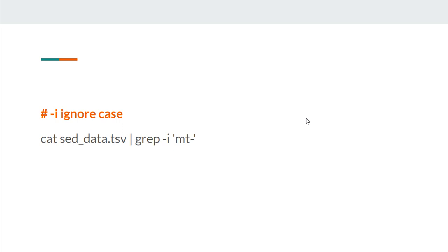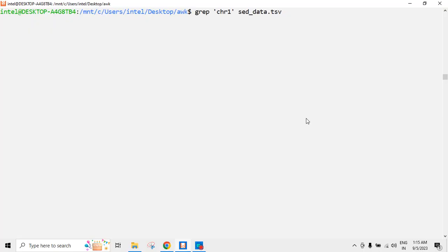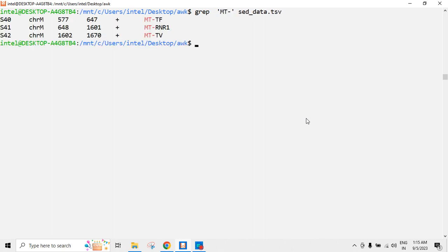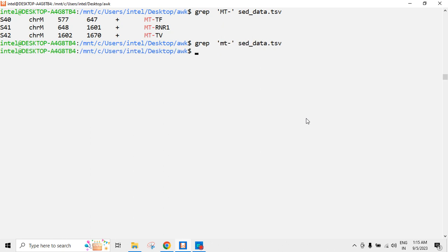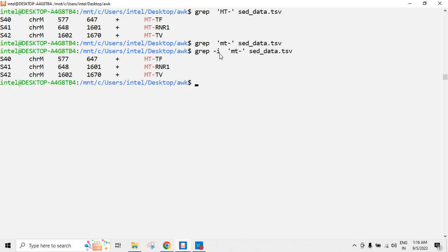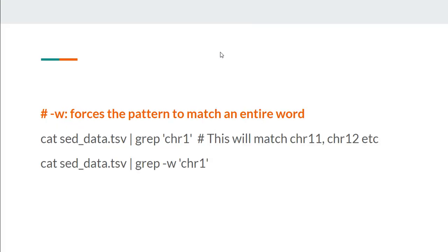The next option is hyphen I, which is for ignore case. For example, if I search for 'EMPTY' in uppercase I get results, but if I search for lowercase 'empty' I will not get anything. But if I give the flag I, it will match because I am saying case-insensitive search. So we have seen hyphen C, N, I, and W.